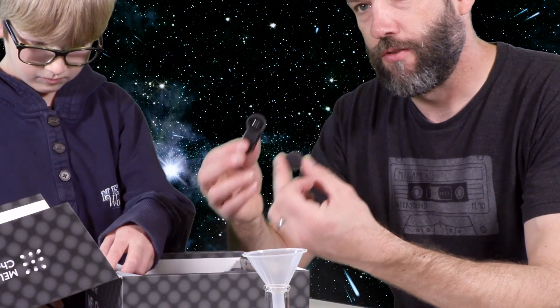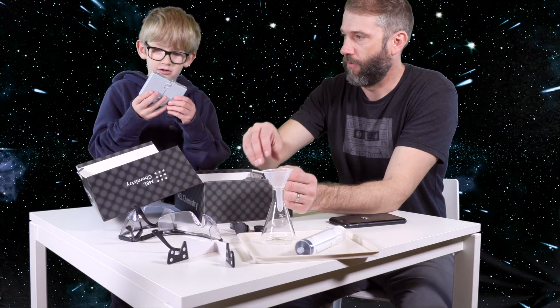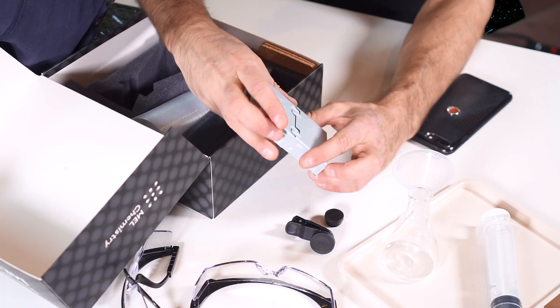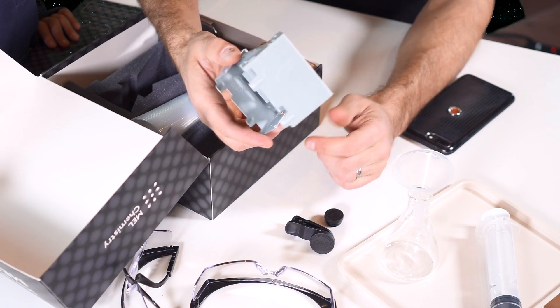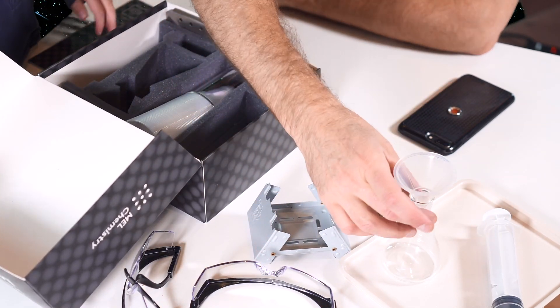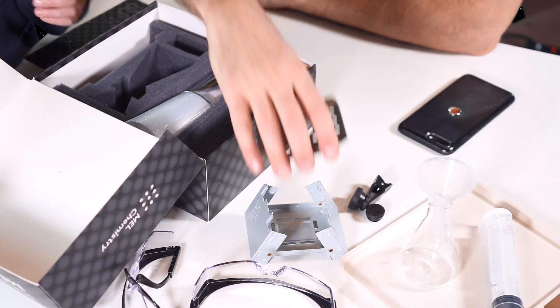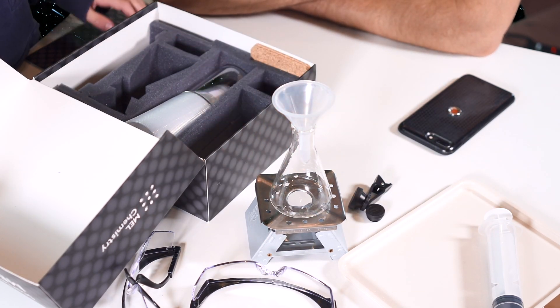Then we've got this little heater — is this a heater? Yes, so this is a little heat burner. I think you put it up like this and then you can put a tea light, or maybe they have a fuel for it, and then you can heat things up. That should be exciting.